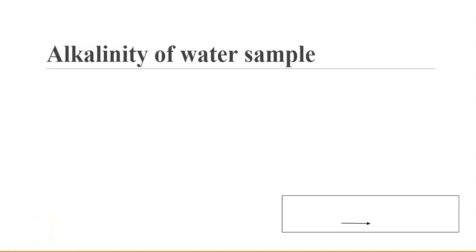Hello everyone. In this session we are going to discuss the alkalinity of a water sample. So what exactly is alkalinity? Alkalinity of any substance can be defined as its acid neutralizing capacity.